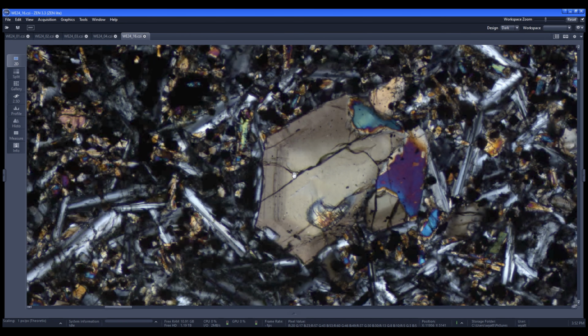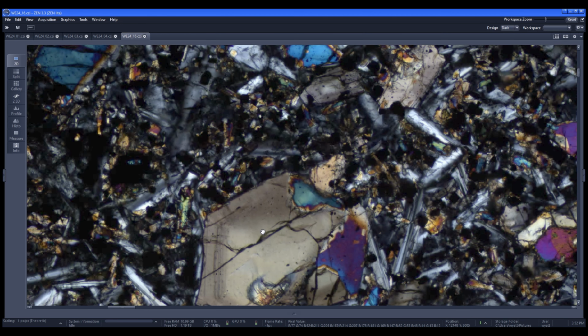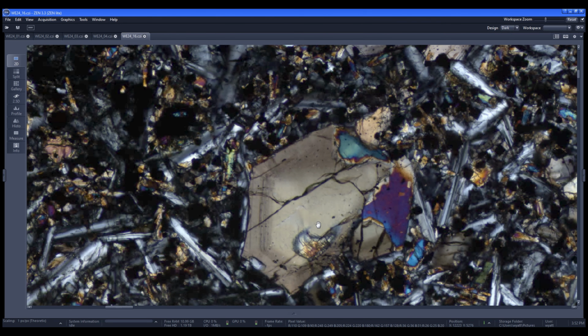This is why they will take samples of rock from volcanoes like Mount St. Helens, when Mount St. Helens was erupting, and even after the eruption. They studied the rocks that came up, and they were able to get a window into the magmatic system and get an idea of what was occurring before, during, and even sometimes after an eruption, and it gives us a good understanding of the volcano. And in this case, it can give you past understandings of ancient volcanism that is no longer happening.